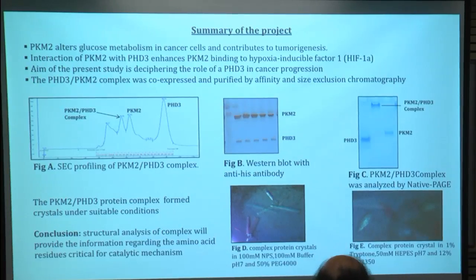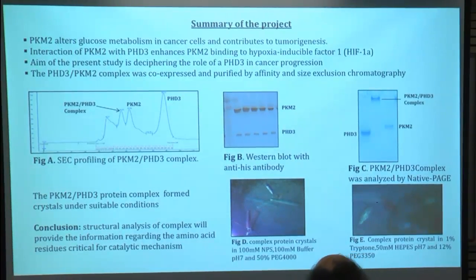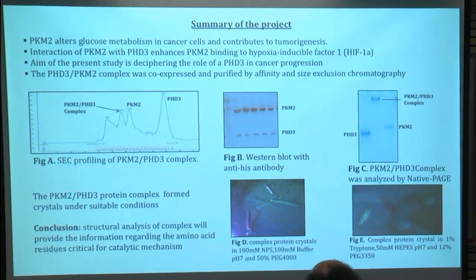And HIF1 alpha induces transcription of targets like glucose transporter and lactate dehydrogenase. So we are targeting how the structure will change when PHD3 interacts with PKM2. So we are crystallizing this complex. We have purified this PKM2 PHD3 complex from gel filtration chromatography.